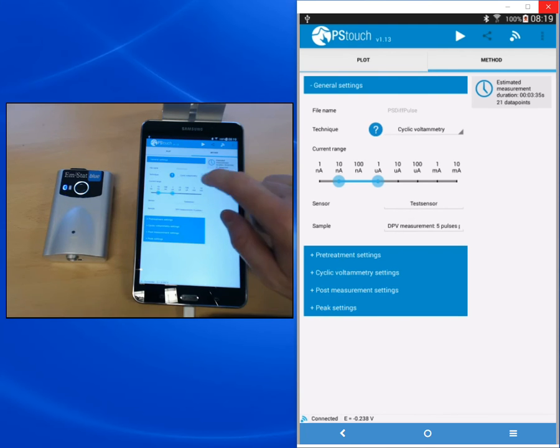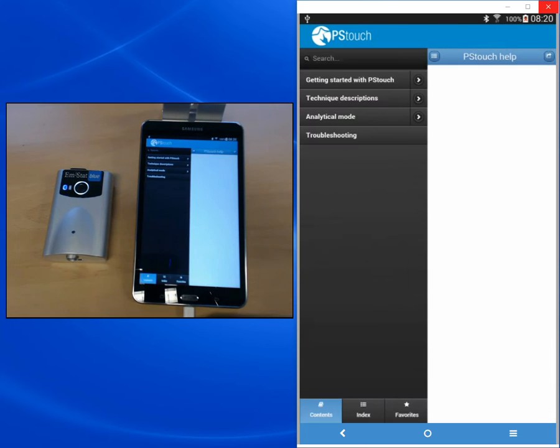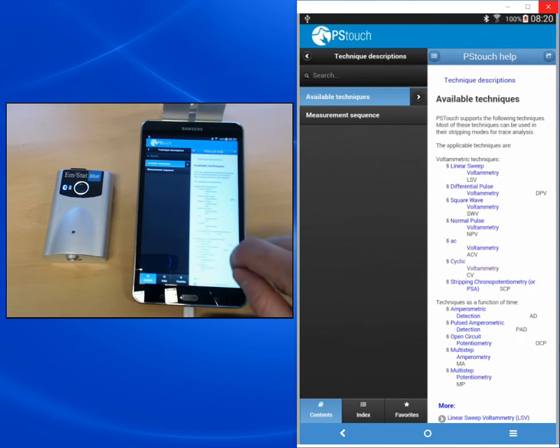Here we select cyclic voltammetry. If you need more information about a technique, just tap the question mark next to the name of the technique. The help file will open on the page for that technique. If you need more information, you can choose from the various topics that are available. Now we go back to the method editor.